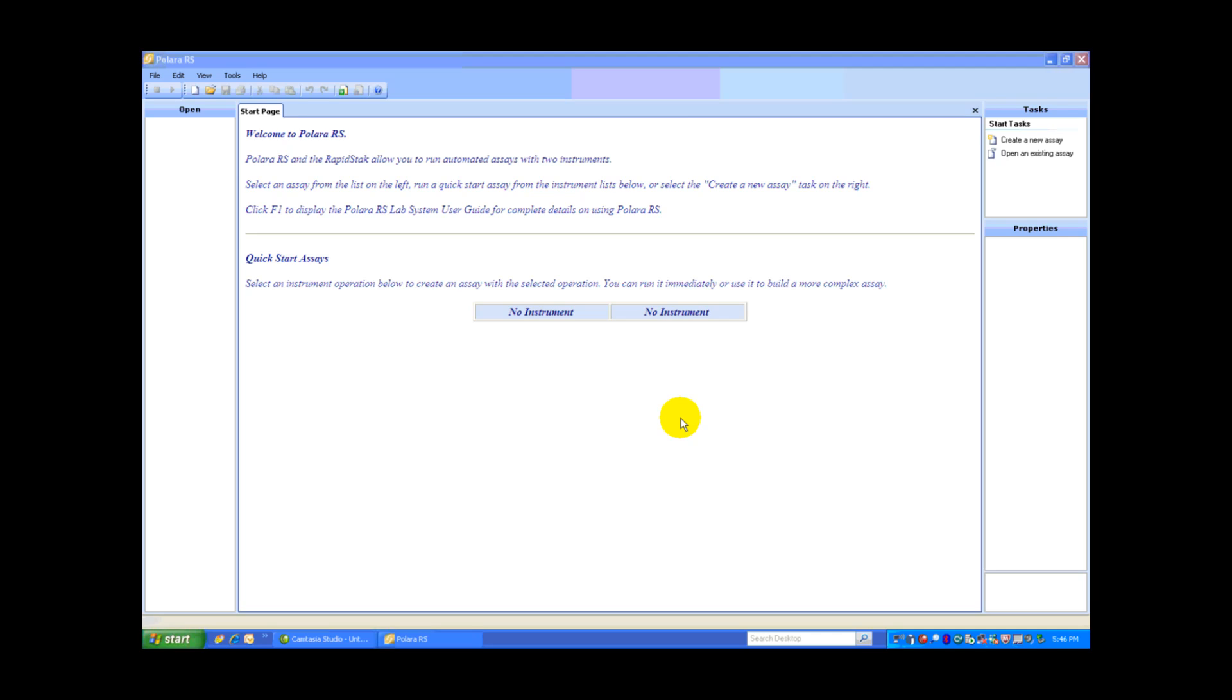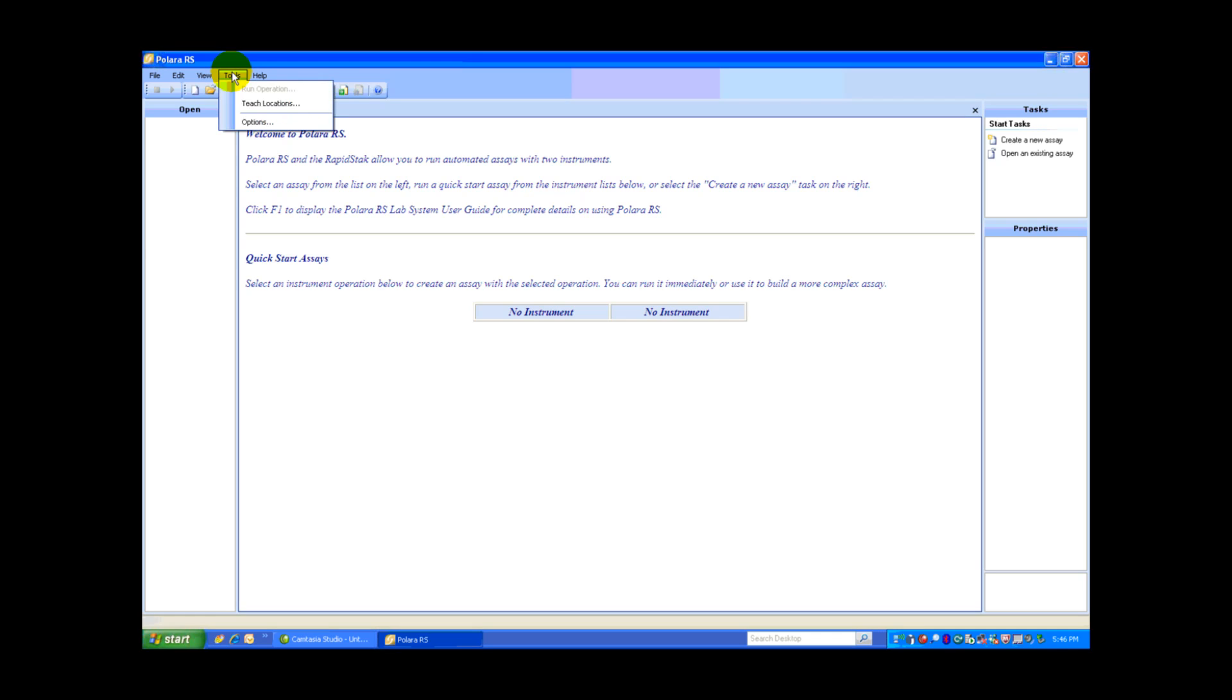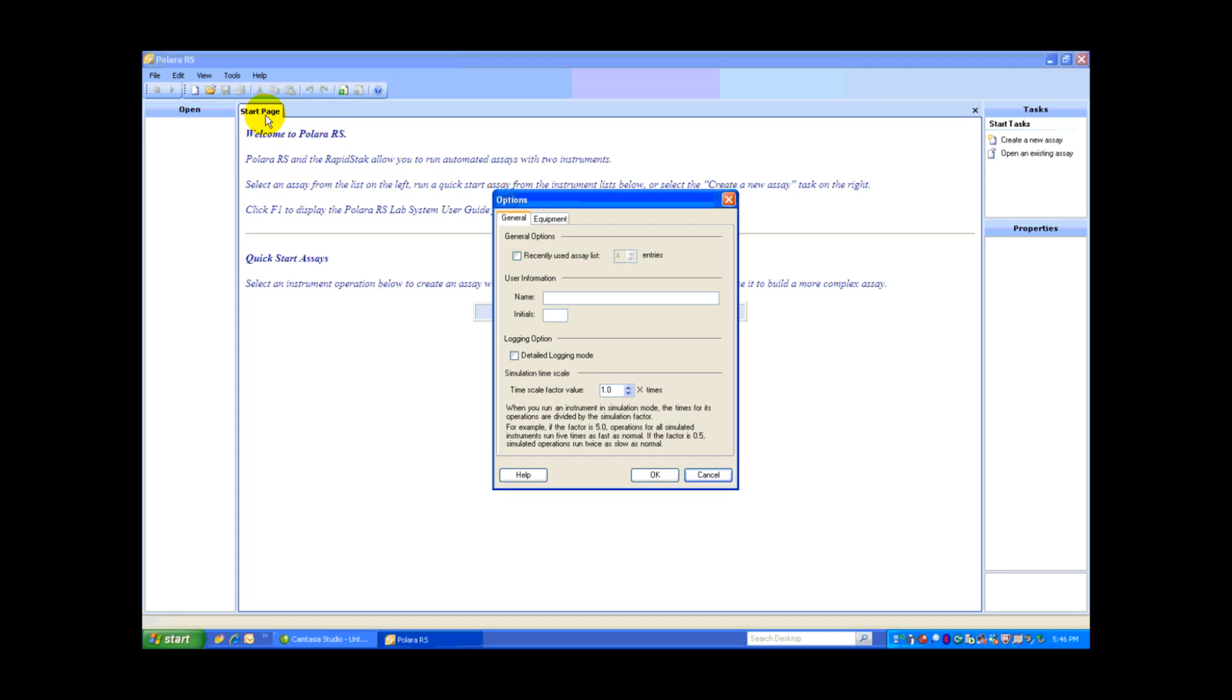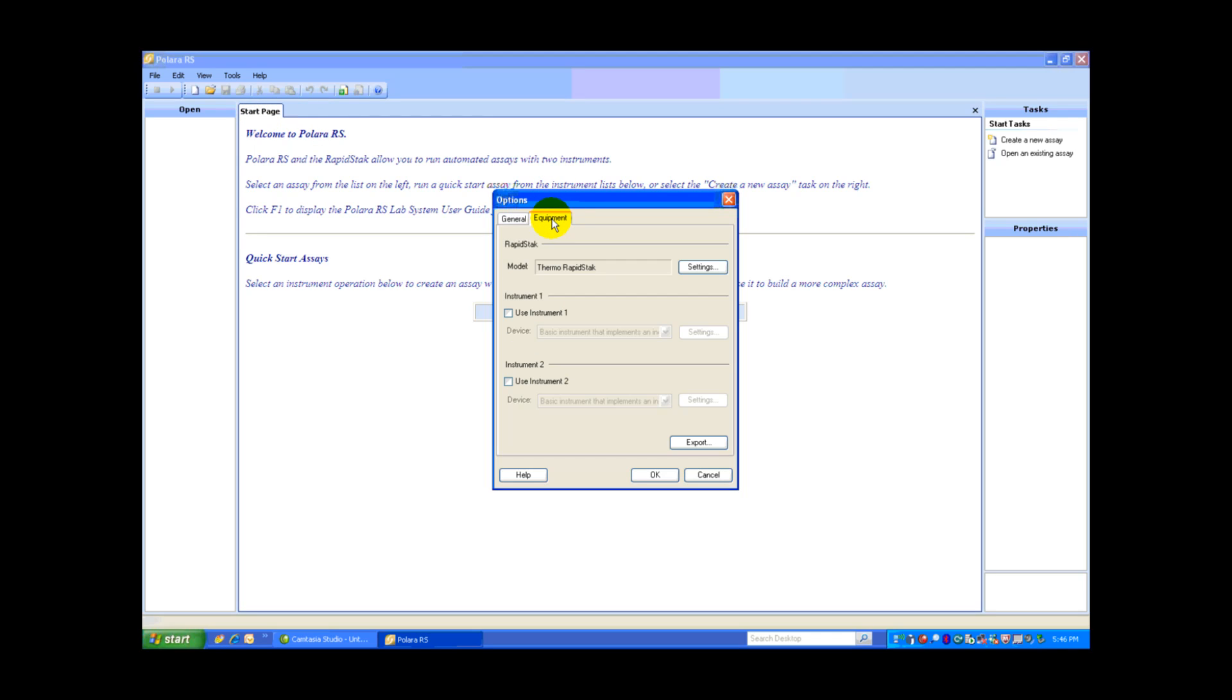The first thing we need to do is add the Versa to our system. All you need to do is go up to the Ribbon Control, select Tools, Options, and the Options window pops up. We'll switch to the Equipment tab.